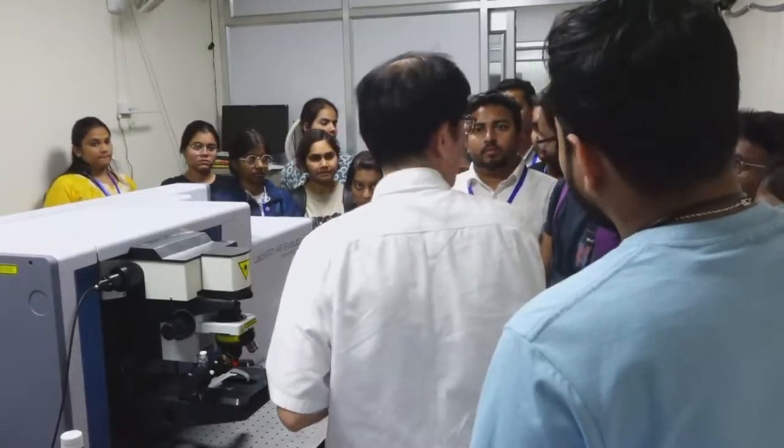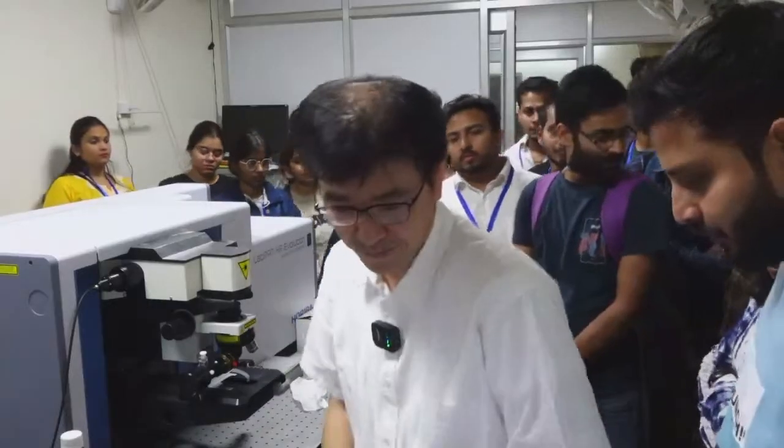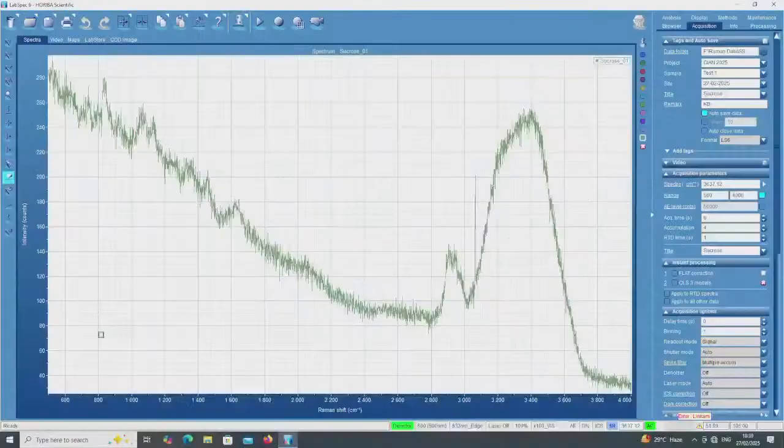Okay, shall we move to the measurement? Yes. Okay. Already we measured the water, so let's go to water again or not? No. So fructose, sucrose. This is water. I have changed it. Okay, then let's start from water. So we do two experiments. One is solvent water. The other is sugar solution.